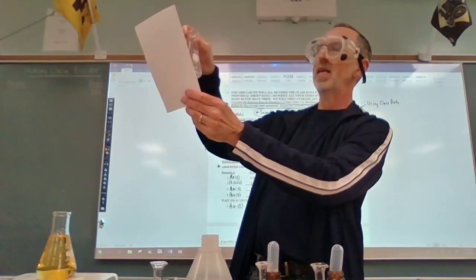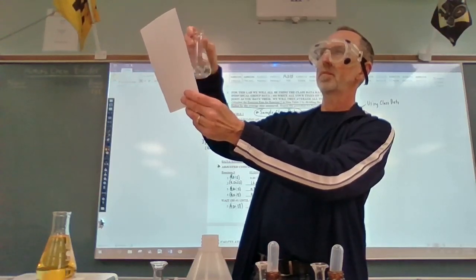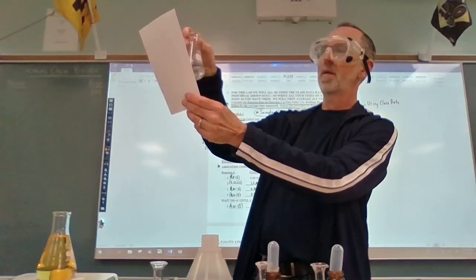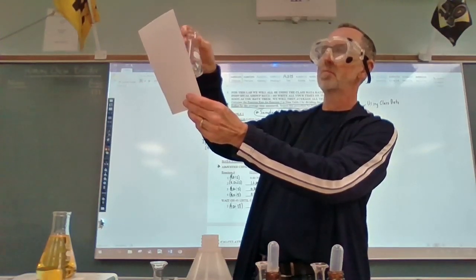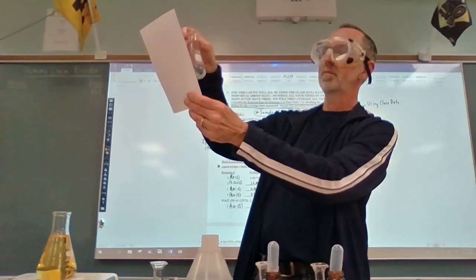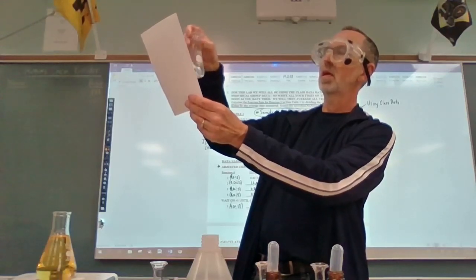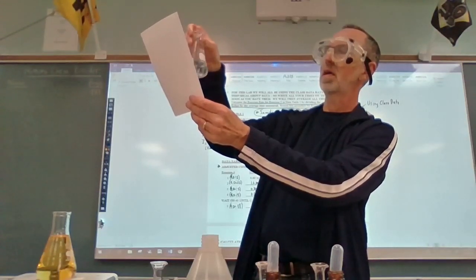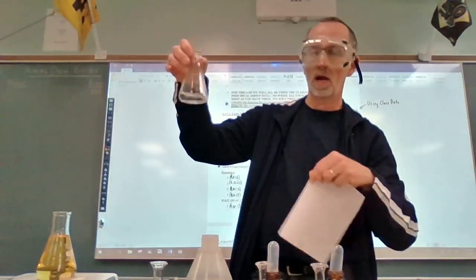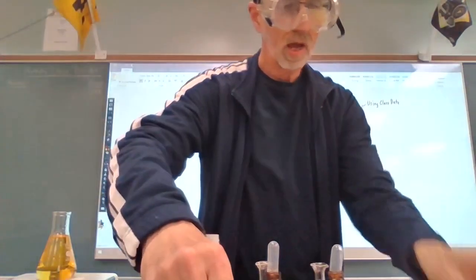It's definitely lightening up some more. We are definitely getting close. I'm going to say we're there. All right. Definitely gone clear. Yep.